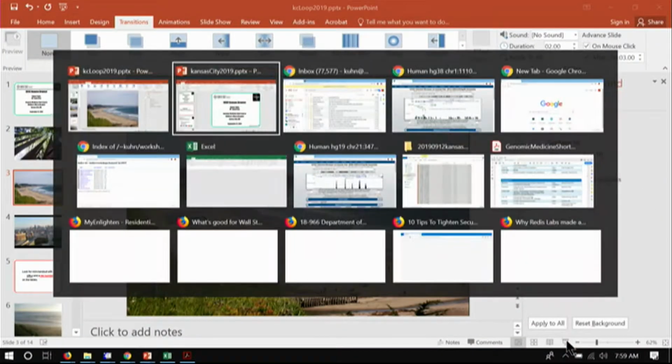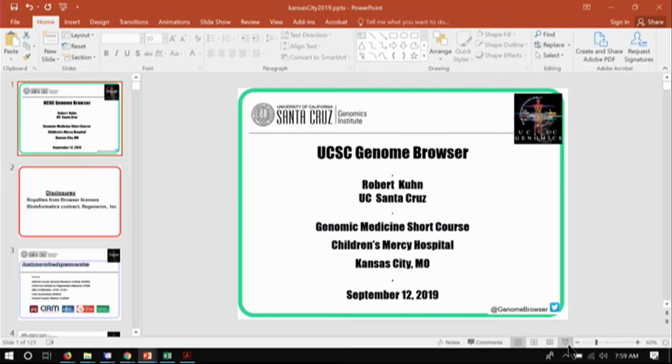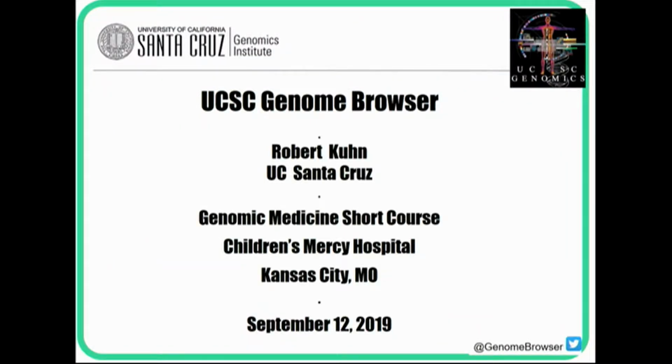But my plan today is to spend a little time with some introductory slides to set the stage, tell you why the browser's cool, and then we'll spend some time playing with the browser and show you some of the things that you can do with it. We're not going to have time to go deeply into many of the features. But as you know, the first step in using any tool is knowing what the tool's good for. And then some things will be useful to certain people and other things for other people. And then you'll have a chance to dig more deeply into it.